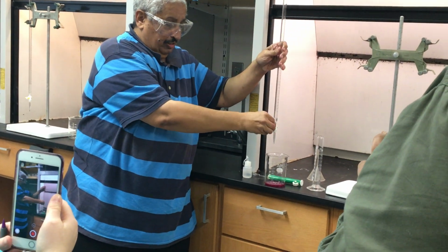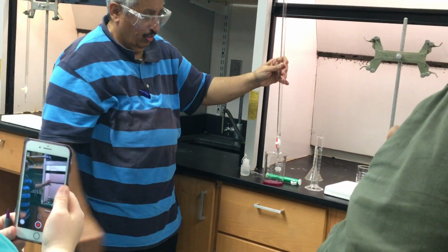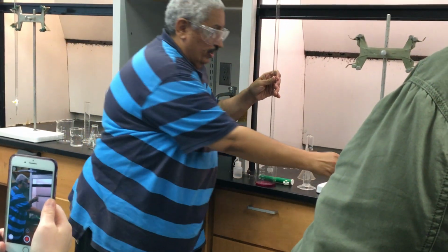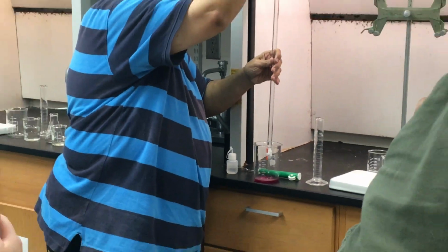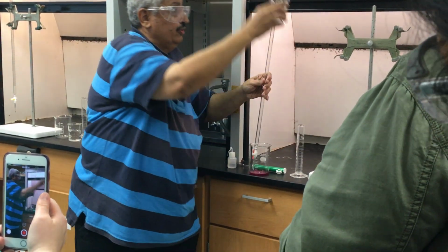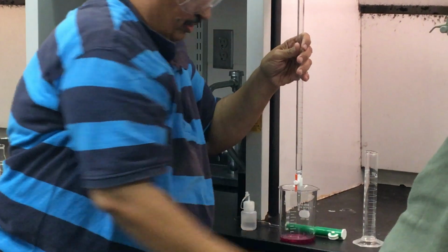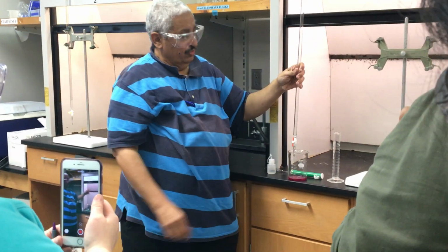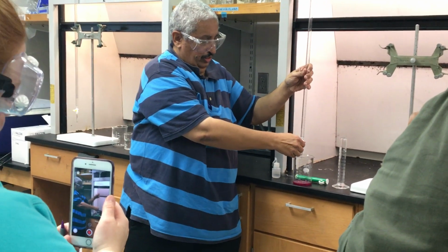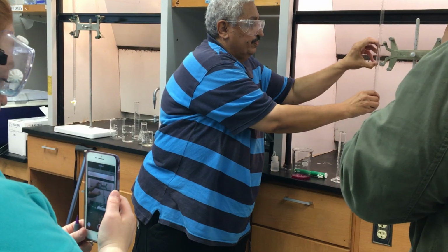Now I open the stopcock. The sodium hydroxide is going through here. Looks like it's stuck, but with the pressure of the sodium hydroxide it will go through. Yes, now you see it's going through, correct? So close it, and now it's time to put it in.